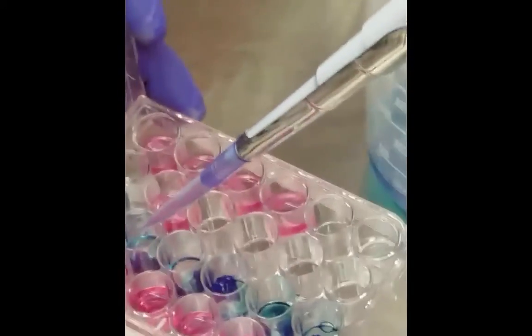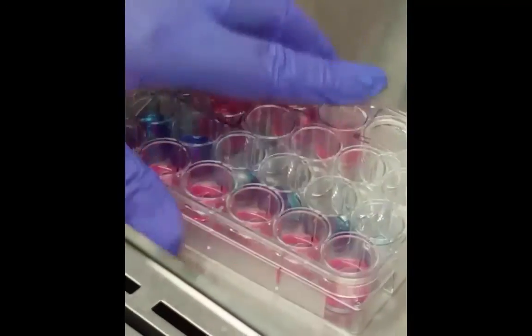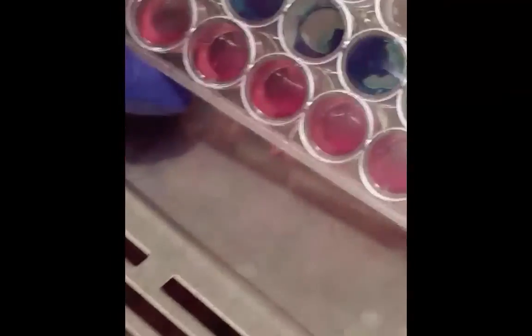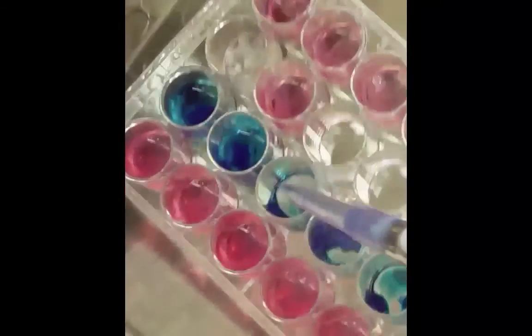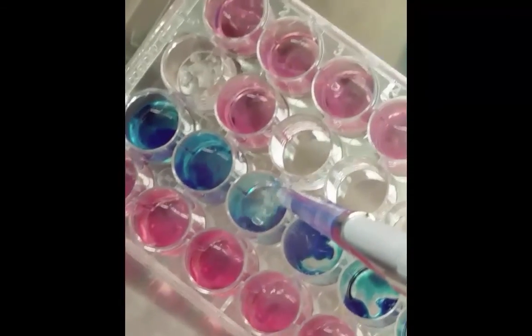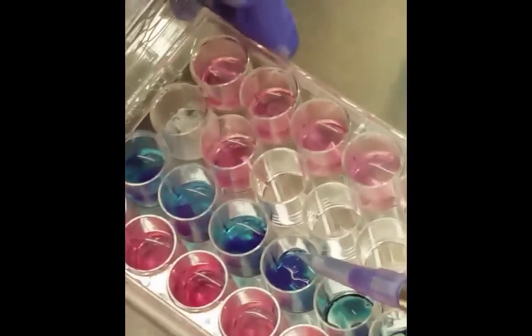Once you've removed all the Alcian blue stain, you'll do your acetic acid wash. So you'll be adding acetic acid to each well. The volume is going to be approximately 600 microliters again. It's enough to cover the gel. And the goal here is to remove excess Alcian blue stain.